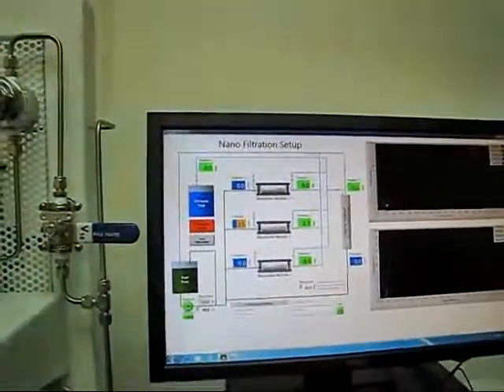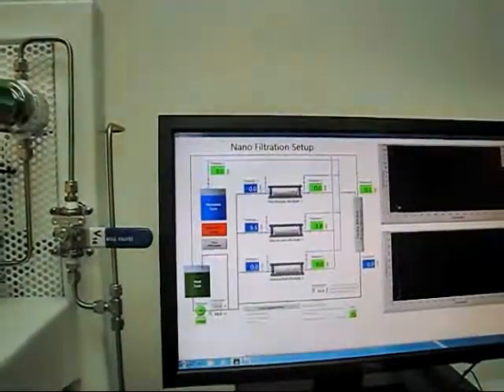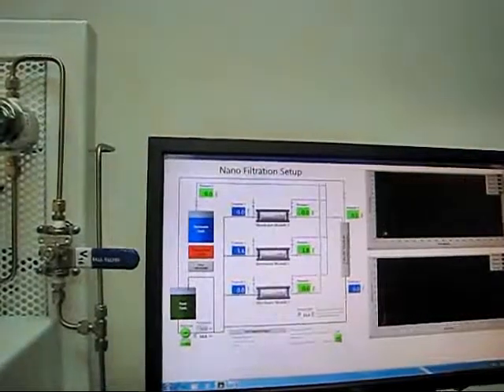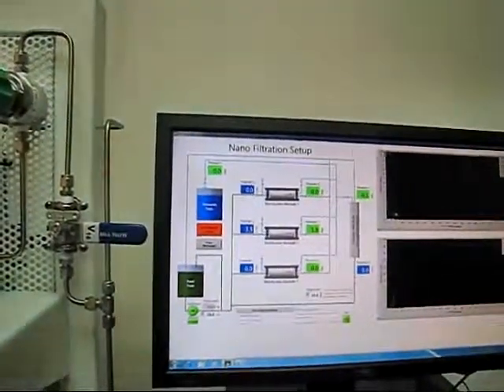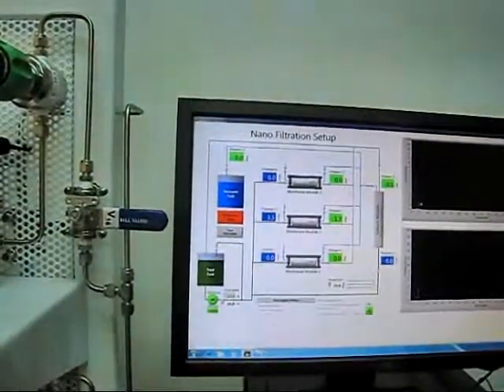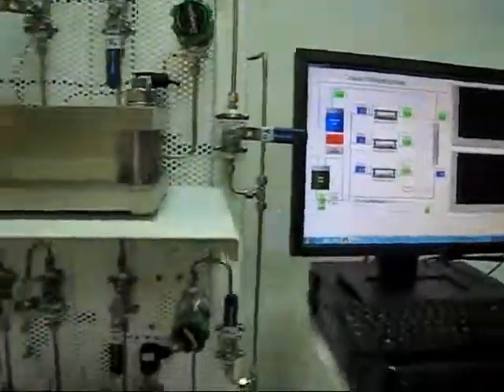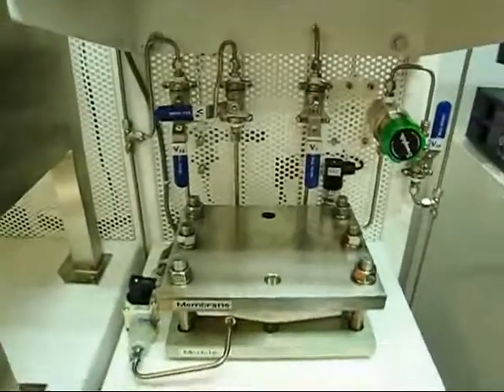I would like to show you the separation with this membrane by slowly turning the back pressure bar to about maybe 10 bar and collect some permeate from the membrane module.